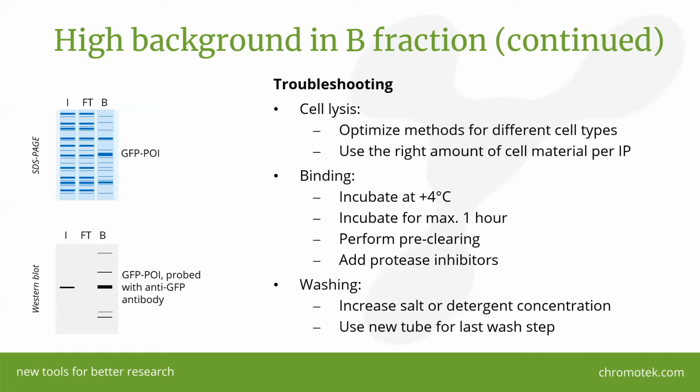In washing, you could also do a couple of optimization experiments. Add detergent or increase salt to wash away unspecifically bound proteins from beads. It is important that you choose conditions where the protein of interest is still bound to beads and only unspecifically bound proteins are washed away.